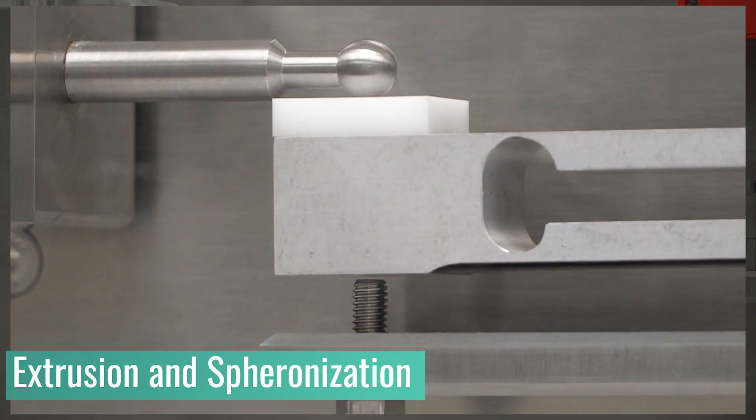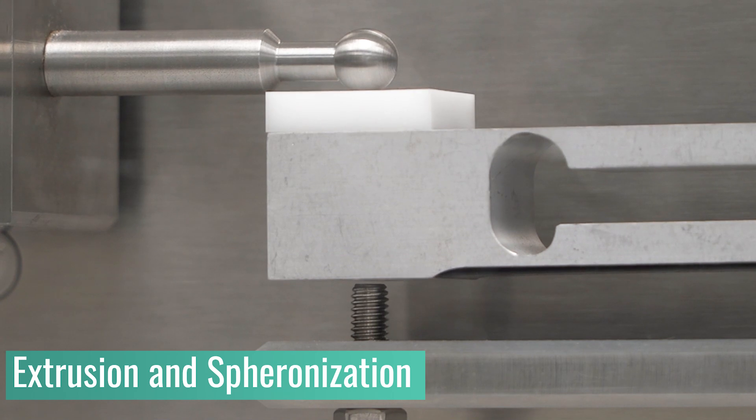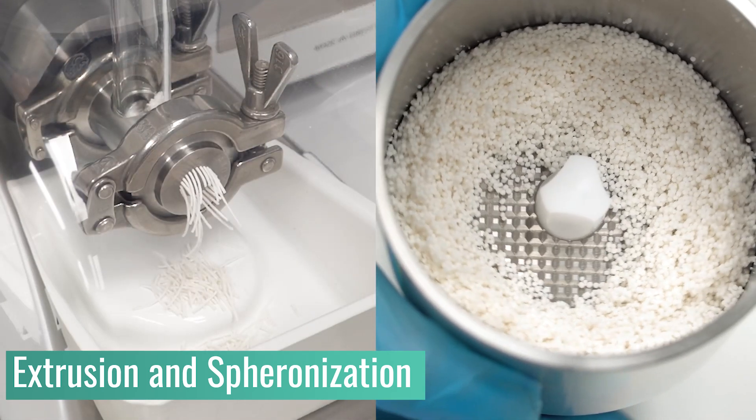Replace the hand squeeze test with quantitative and reproducible measurements to quickly optimise your formulation for extrusion and spheronisation.